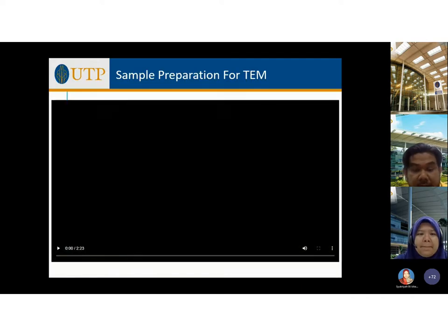Okay, on the next slide we show a video on basic sample preparation for TEM. Hope you enjoy it.